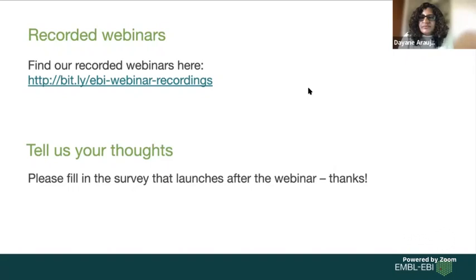Is there any specific software for SEM? With SEM you probably mean serial electron microscopy or something, specific software or method. There is, I think MIB is the name.